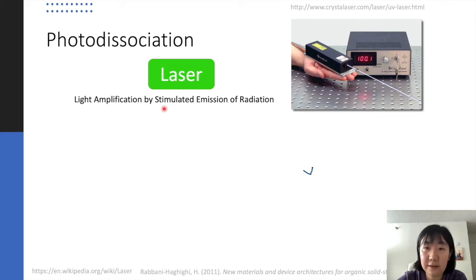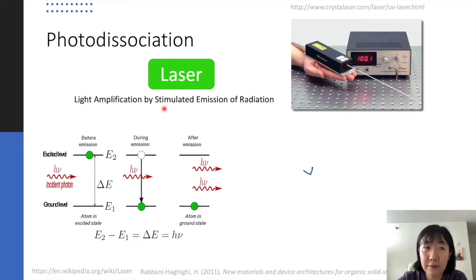And how do we get a laser? There's a lot of theory in it. We only need to know that we introduce some photons to a gain medium, and the atoms of the gain medium absorb energy, which raises some electrons into excited quantum states.